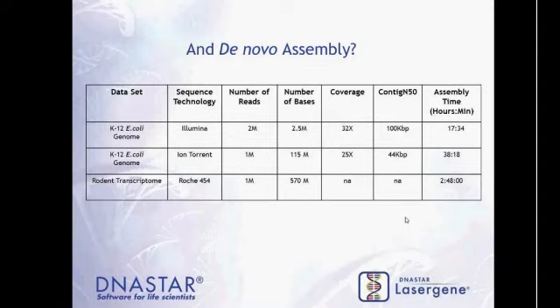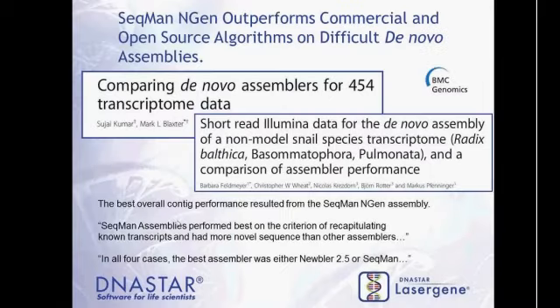And it can be very difficult to assess the quality. So we like to do things like align genomes that have been closed and finished so we can check the accuracy of our contigs. And then with transcriptomes, there are some other kind of metrics that you can use.